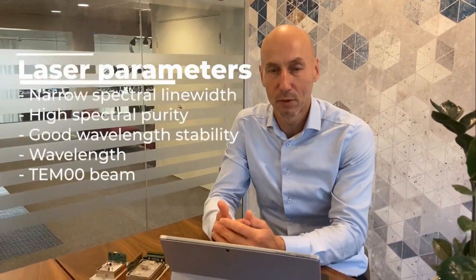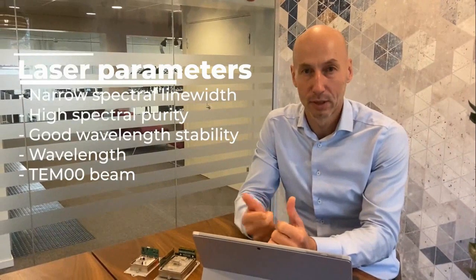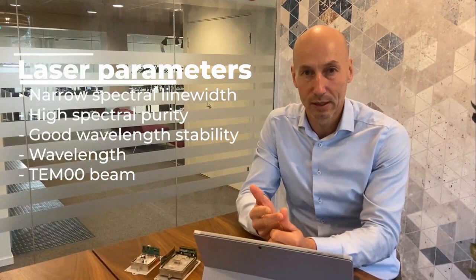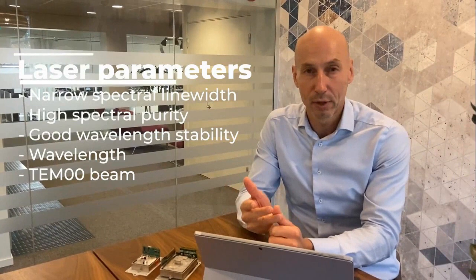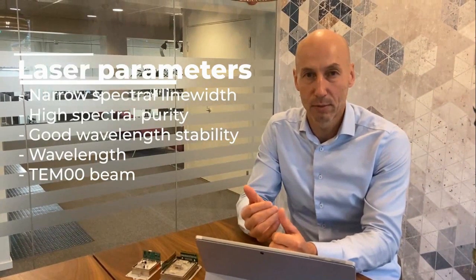So, to summarize, we can conclude that Raman spectroscopy is a very powerful technique for chemical analysis that can be used in many different applications and in many different industries. We have concluded that the most important performance parameters for the laser used in a Raman setup are the narrow line width, the spectral purity, the wavelength stability, having the right wavelength for the application, and also very good beam quality, at least if it's for high resolution Raman imaging.